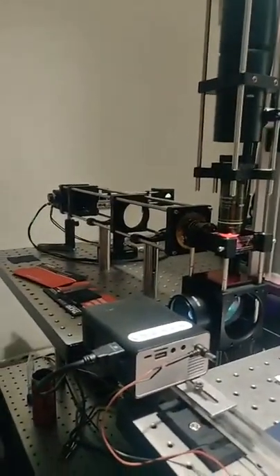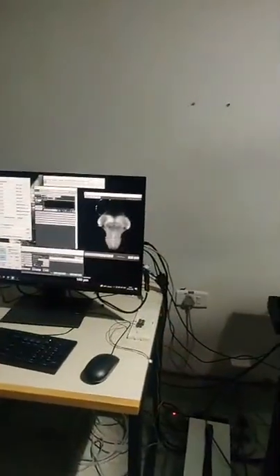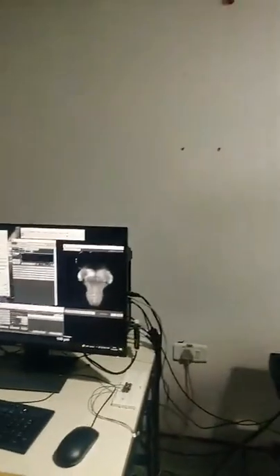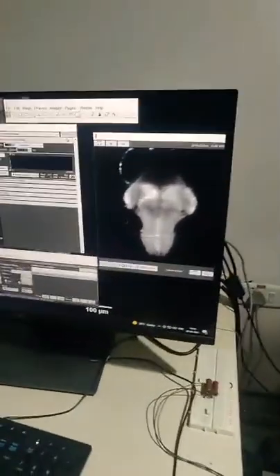And then it sends to the computer. Exactly. So you are giving some stimulus to the fish here as well? Not right now, but that's the eventual idea. The same thing that they will do, the electrophysiology. So this is something in process. Exactly. It's still a work in progress. Wow. But we will do similar experiments to what they're doing. Okay. Yes. So if you want to look at some images and some single neurons, we can take a look.